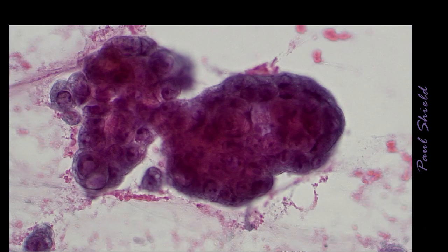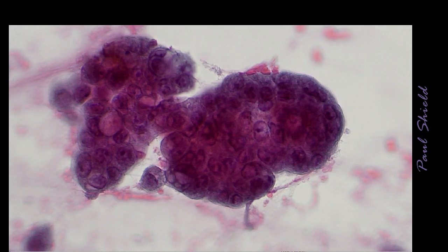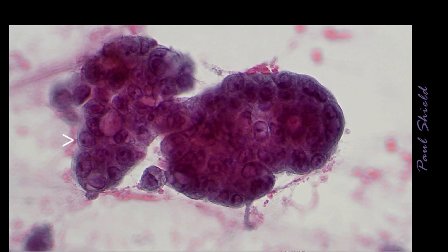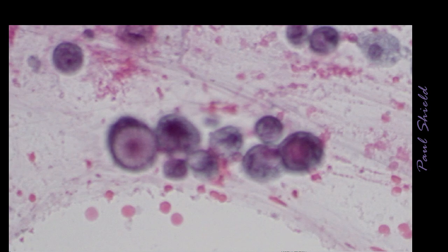You can see eccentric nuclei in it. You can see vacuoles, I think, that I'm bringing into focus now, and probably little nucleoli in all of the cells as well. So this is that classic glandular grouping.